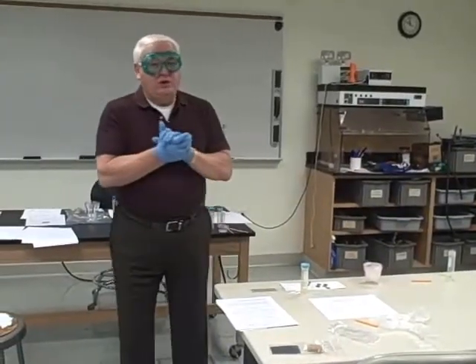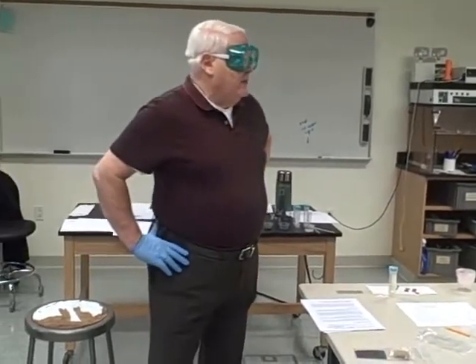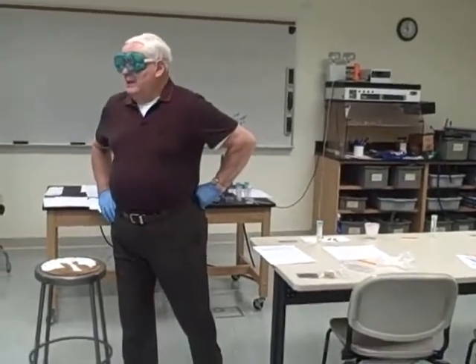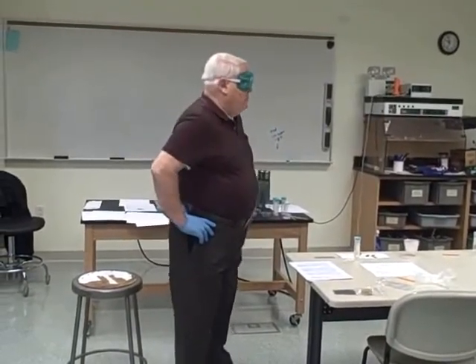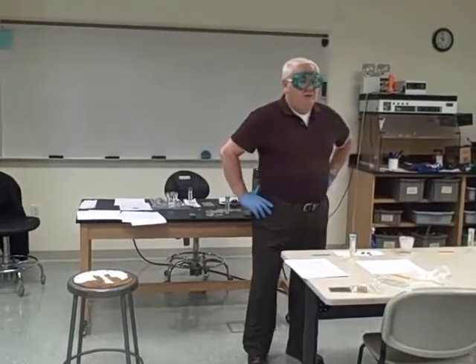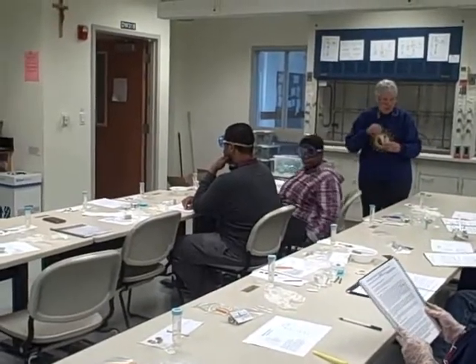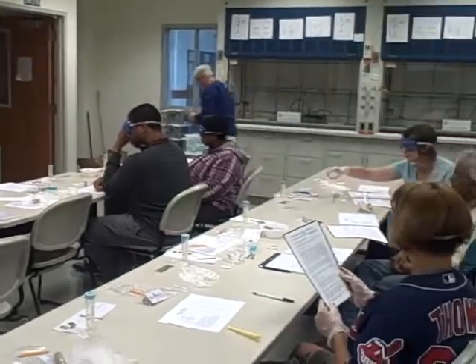At this point, we're going to go to an experiment where we actually test the reactivity of various metals in both water and weak hydrochloric acid. If you have an assistant, now is the time for your assistant to pick up the 3 vials of 0.25 molar HCl that are marked 4 and fill the cups marked 4-2 about halfway.